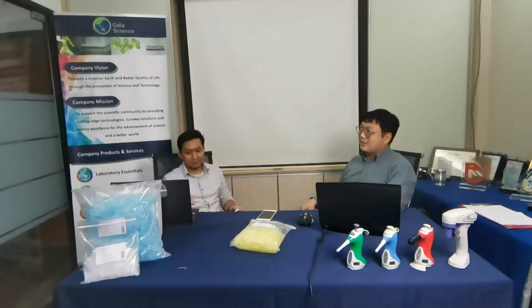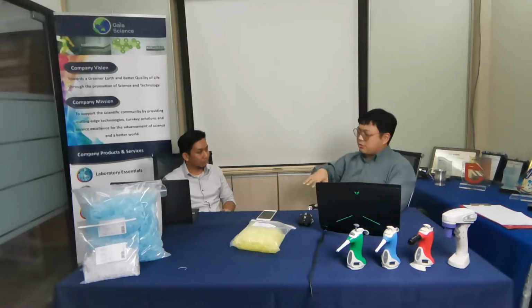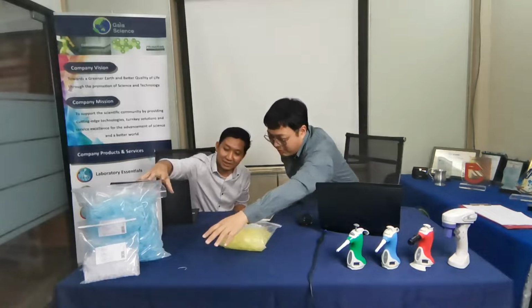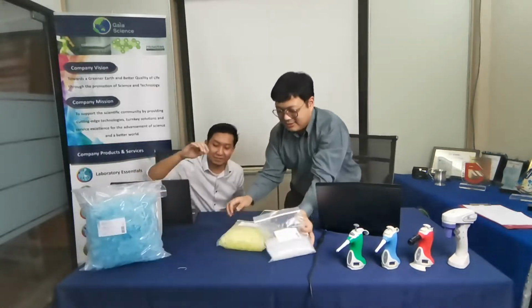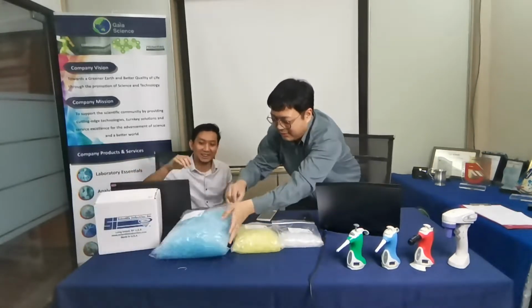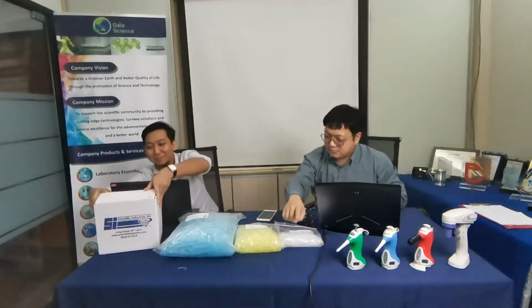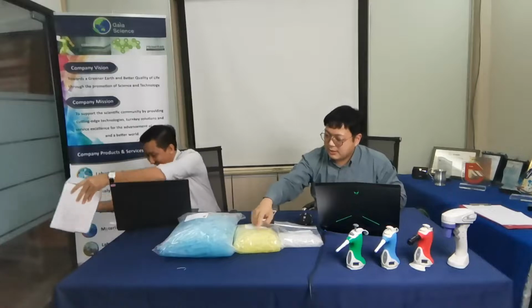Good question, actually. Normally, the three existing sizes available in the market are the 10, the 200, and the 1000. Let me backtrack a bit here. Actually, it's more about the colors first. When you see the colors right here, you can see the white color, the yellow color, and the blue color.